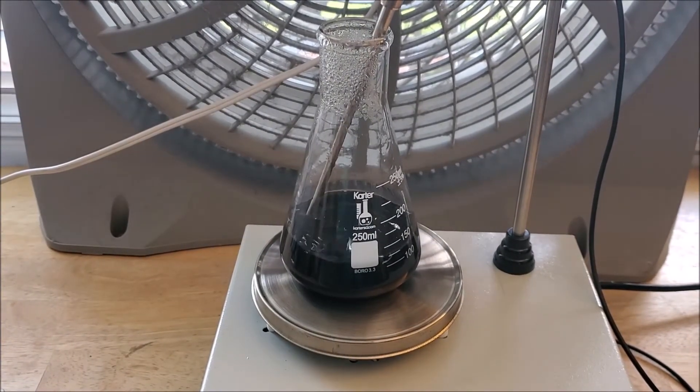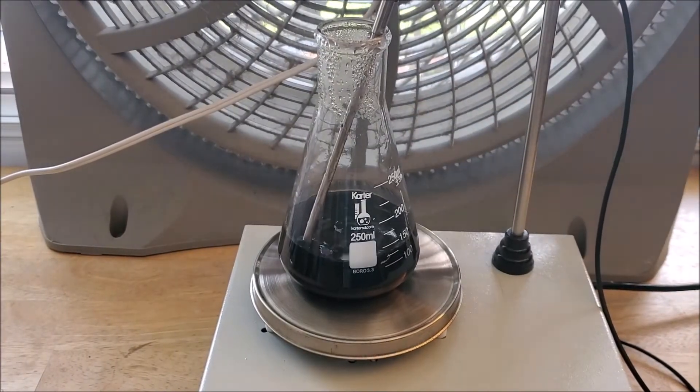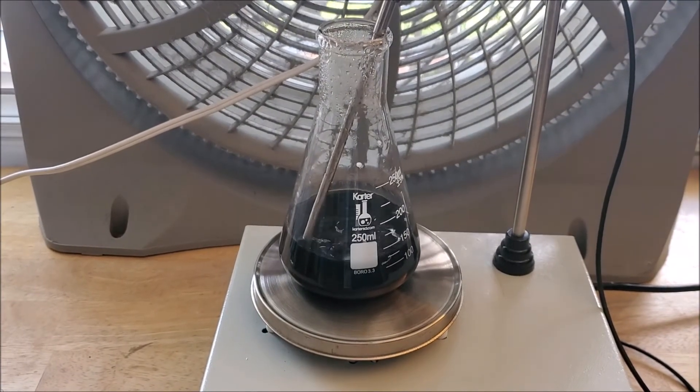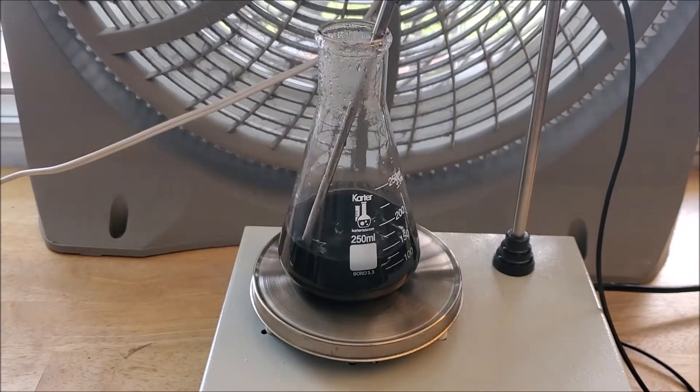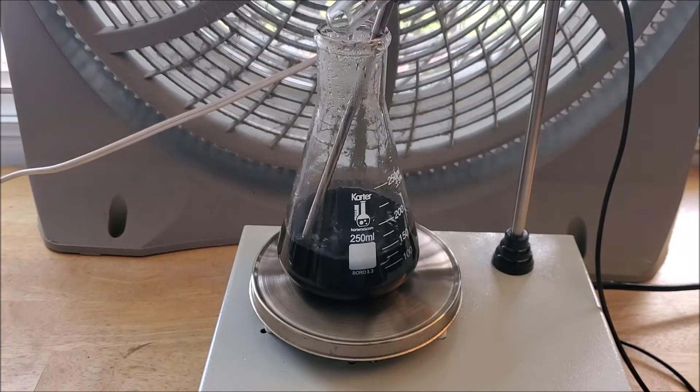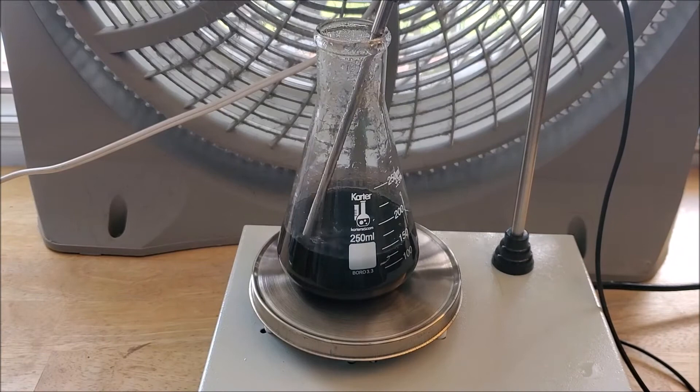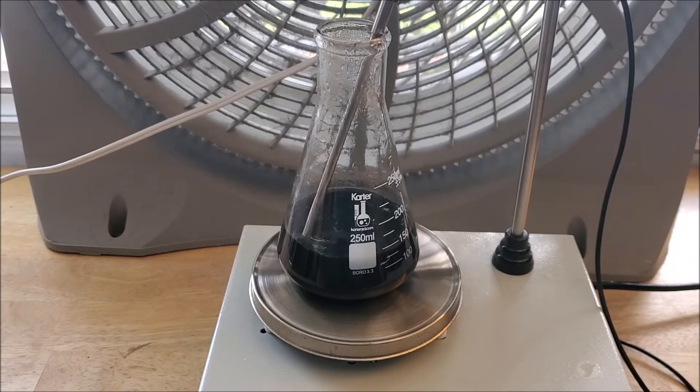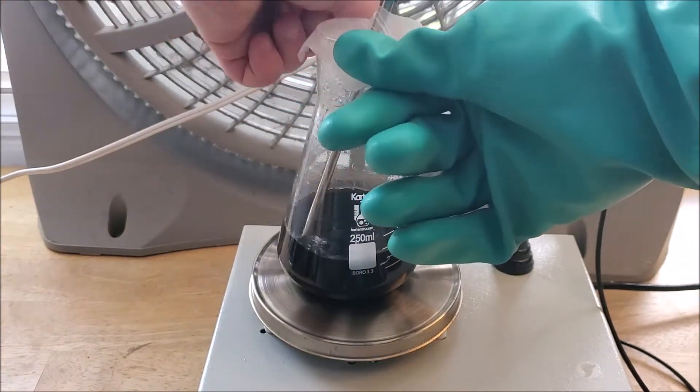After that, we heat the solution to around 80 to 90 C. We have to let it stay at 80 to 90 C for the next 90 minutes. And here you can see I finished by adding my 6 milliliters of acetyl acetone and that finishes this step. Now I cover it with a little bit of parafilm and we wait 90 minutes.